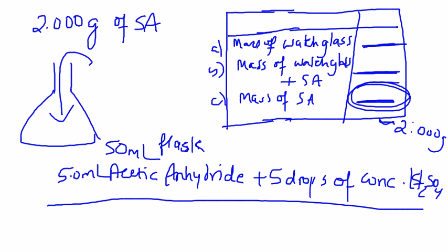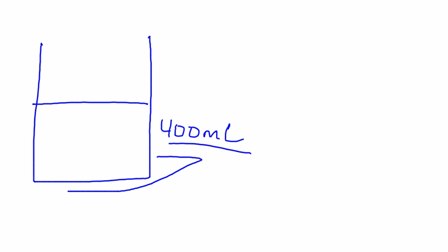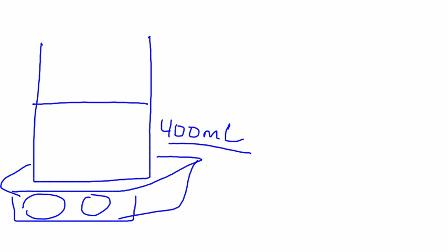If you plan to use the water bath, my suggestion would be that you use a beaker, just so that the water bath gets heated quicker. Make sure that you have a thermometer inserted. So let's see a picture of that. If you decide to use a water bath, here's your beaker. Probably a 400 milliliter beaker would be good, filled halfway.